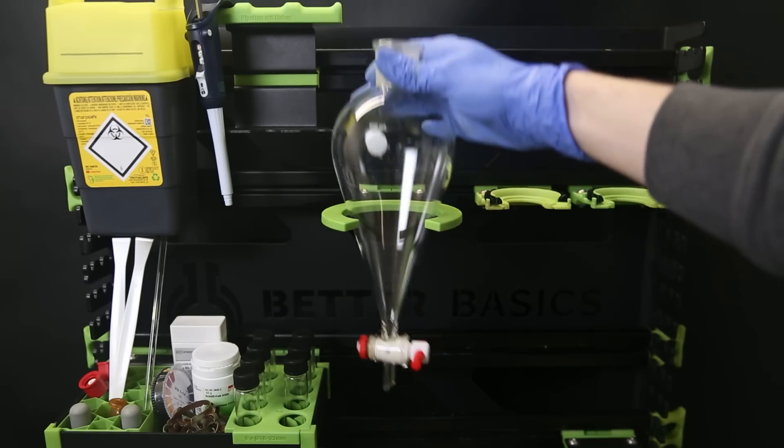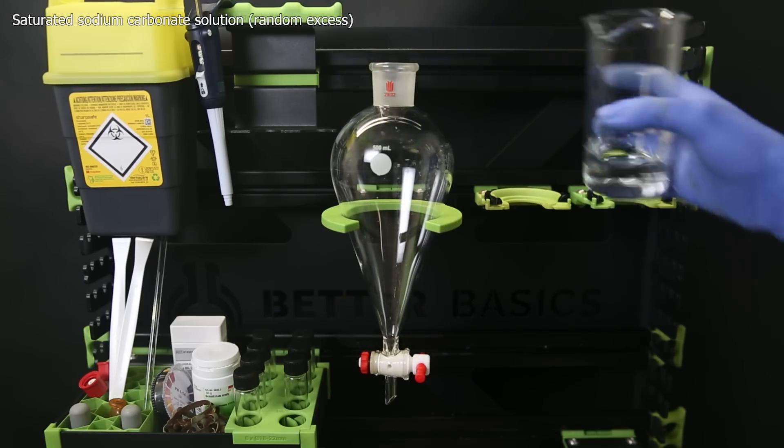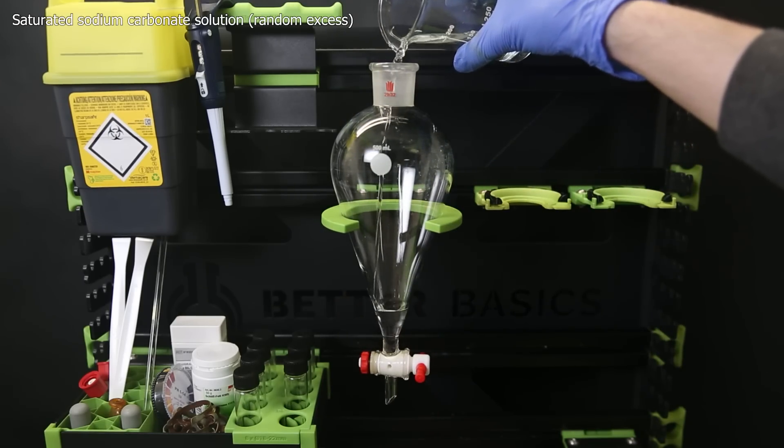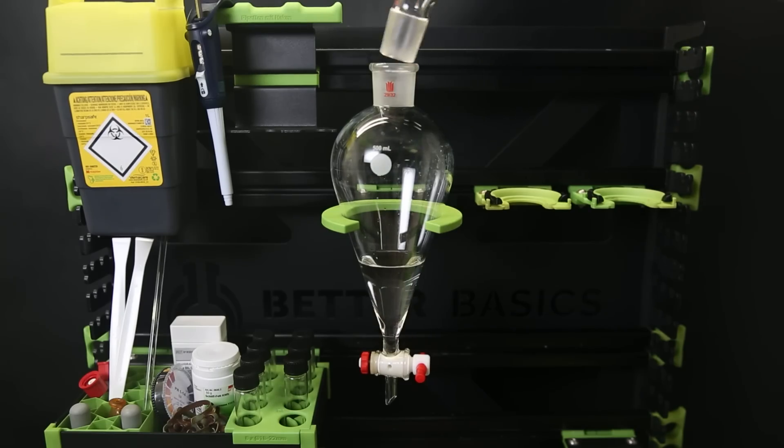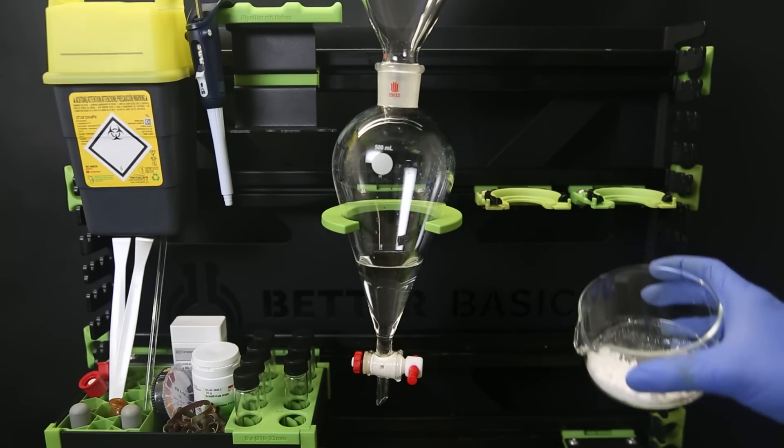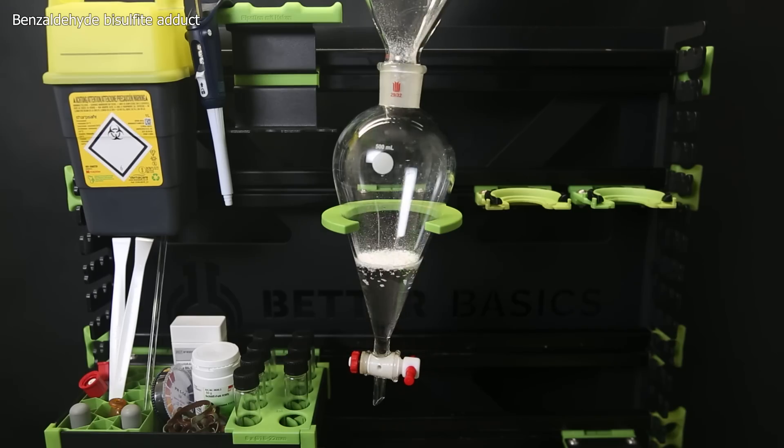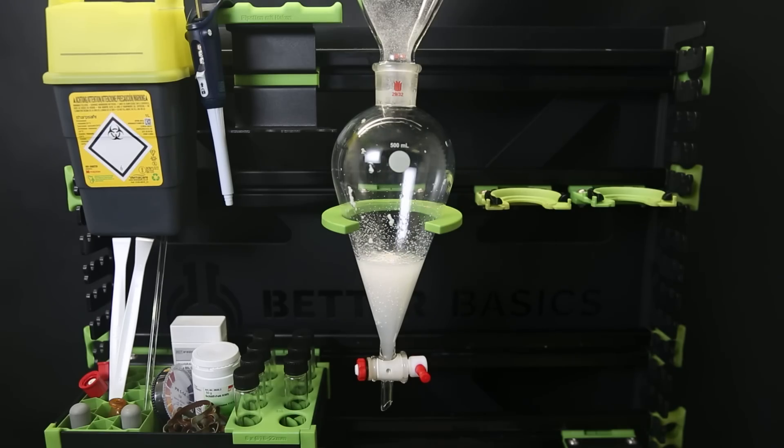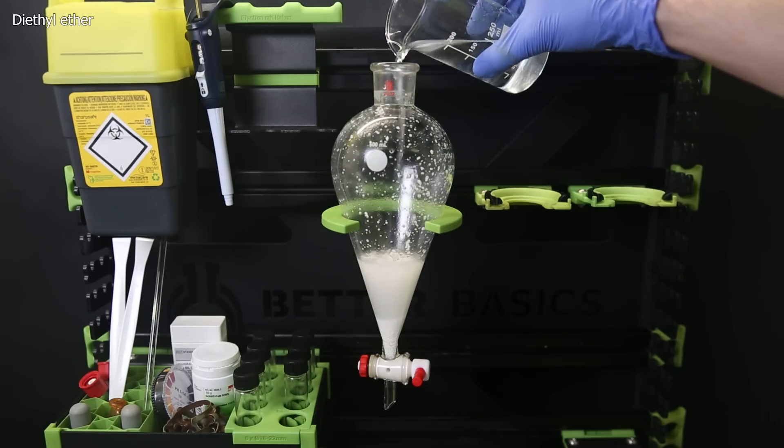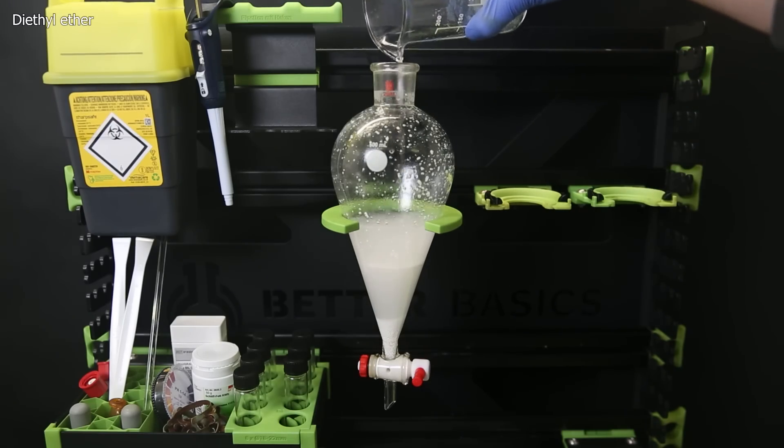Moving on with the next step, where we destroy the bisulfite adduct to return the benzaldehyde. So I set up a separatory funnel again and add in a saturated solution of sodium carbonate. I then add in all of the bisulfite adduct. I shake it strongly and add some more sodium carbonate because he did it too. I also add some diethyl ether to already start extracting the benzaldehyde.